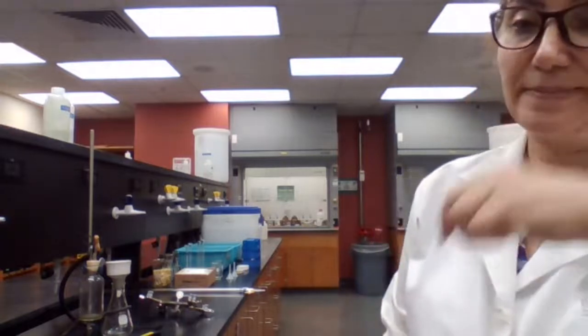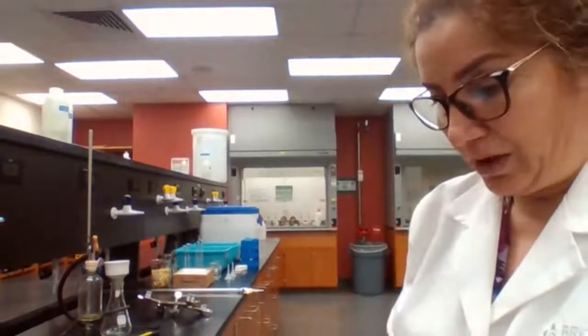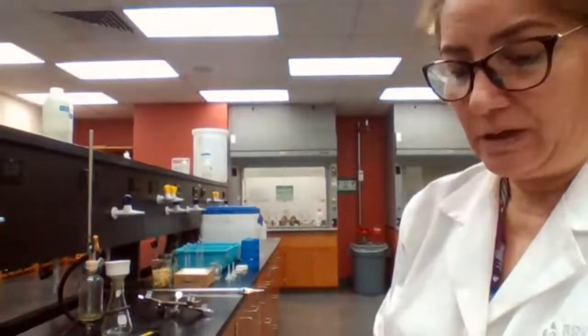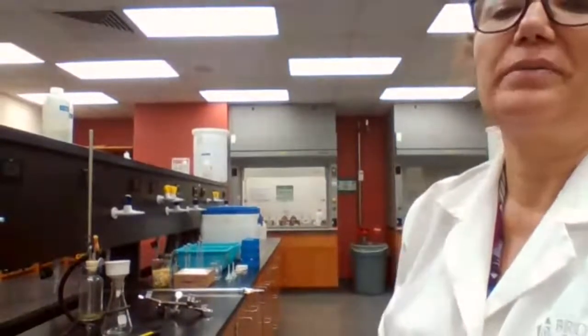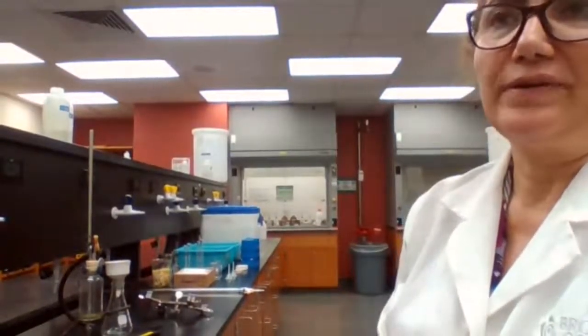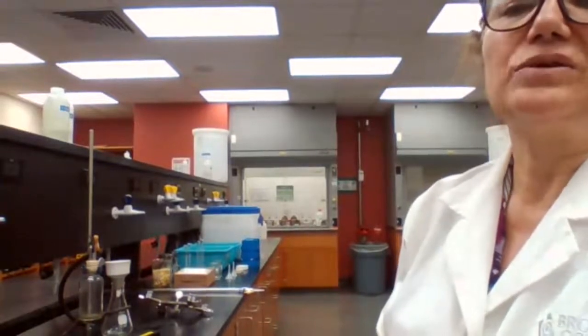Okay, solubility test. Based on the solubility test, if the compound dissolves in water, it could be any polar compound. It could be ketone, aldehyde, alcohol, or carboxylic acid with less than 5 carbon. If it doesn't dissolve, then you don't know what your compound is. You have to continue with the solubility test. Your next step is adding sodium hydroxide.